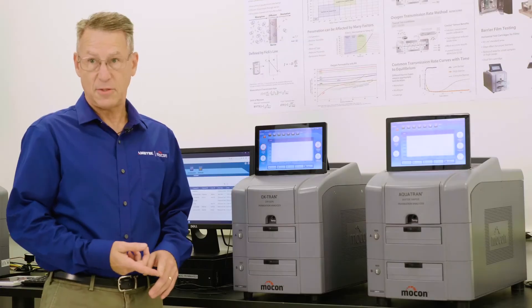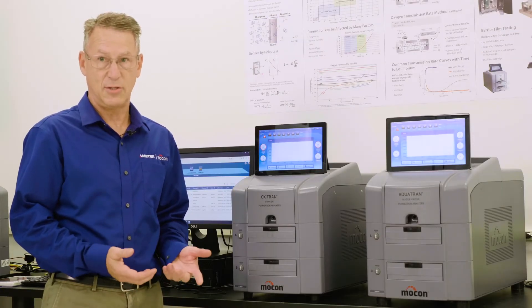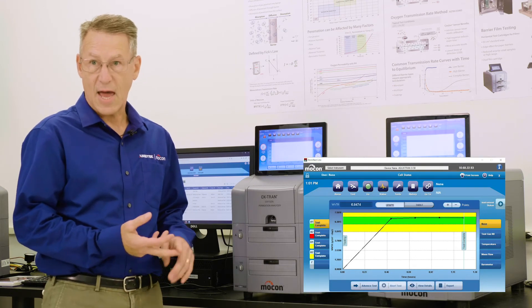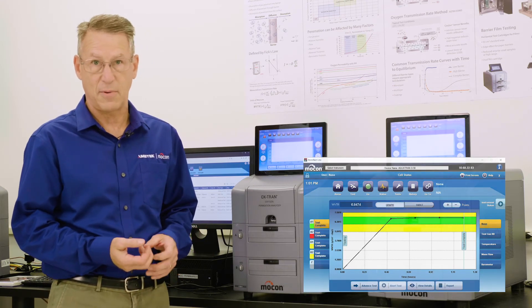The specially designed QC mode software guides the technicians through a simplified test setup, testing status, and actions on the results to make them easier for the technicians to operate.